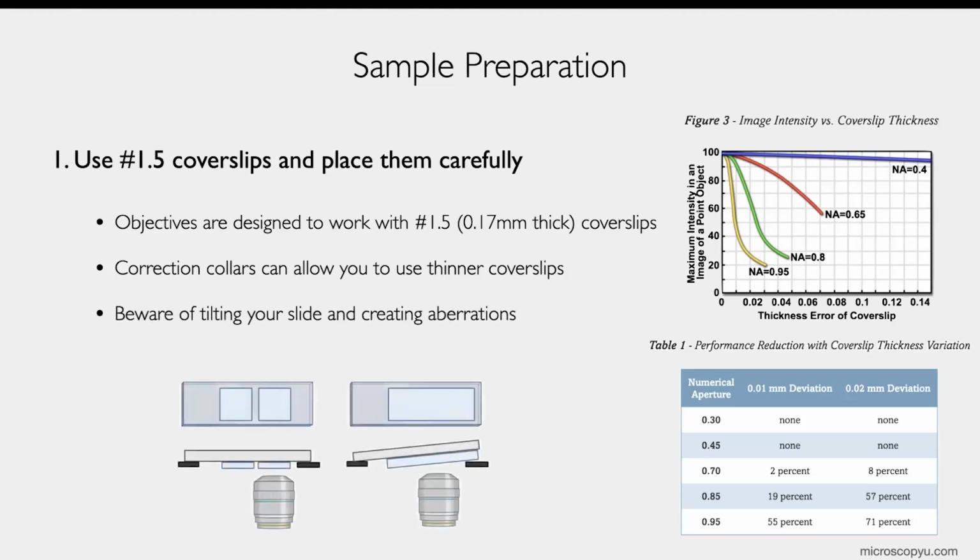I've mentioned that it's not always the case. There are situations where you might be working with a difficult thick sample using an oil objective, and you may want to use a thin cover slip, and you're mounting in something that has the same refractive index as glass. Ordinarily, especially for most projects, just using the right cover slip is the way to go.